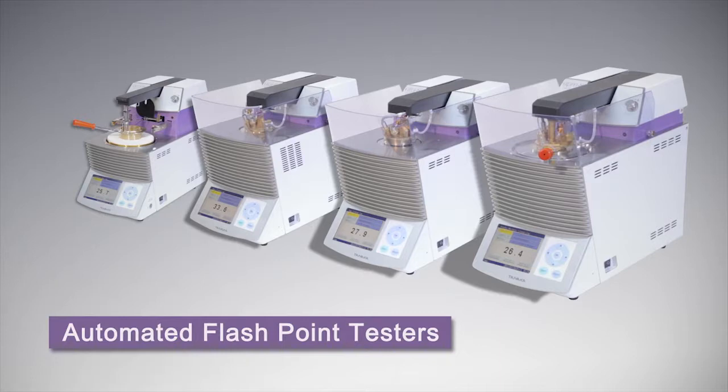Tanaka Scientific Limited, the leading manufacturer of petroleum testers in Japan.